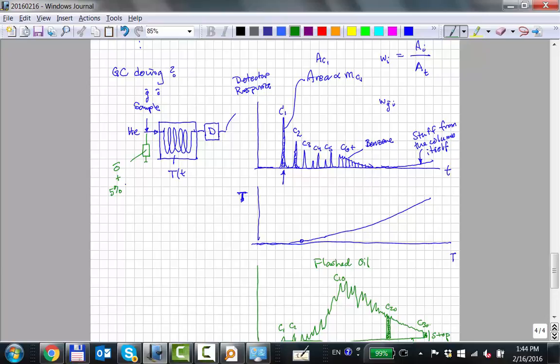I'm just going to call it X. It's some strange hydrocarbon that you should not find in the oil. Let's make it, what color do you want to make it? Pink? Okay. So we know the mass fraction, 5%, in our little sample that we inject into the container.